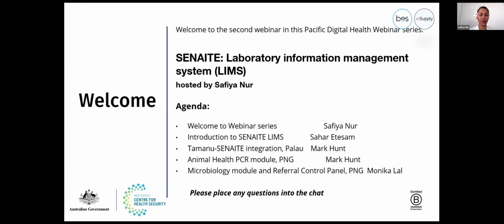The topics are Introduction to SENAITE by Saha, then Tamanu and SENAITE integration in Palau by Mark. Also, Mark will be taking us through the PNG context, which is for the animal health PCR module. And lastly, we will have Monica join us about the microbiology module and referral control panel for PNG.